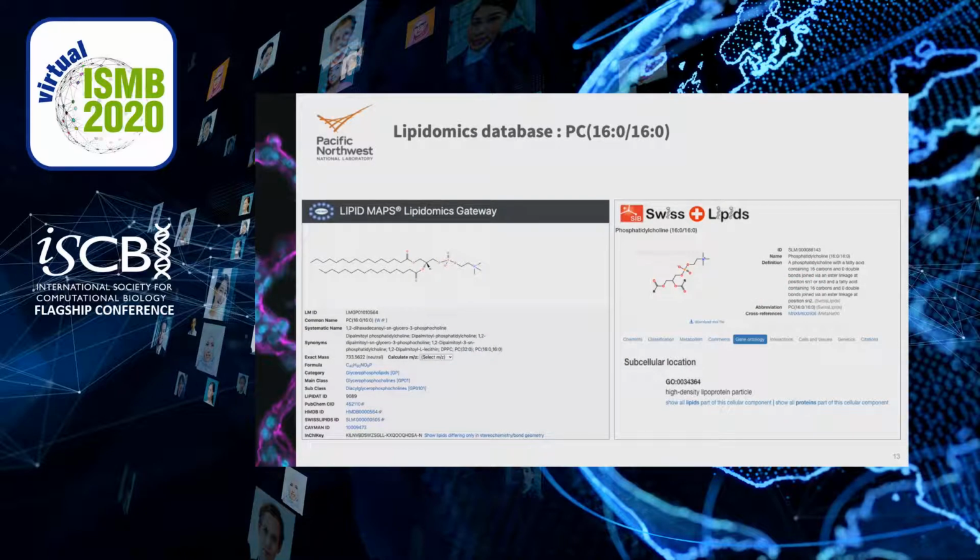Even today, if you look for this very specific lipid on the 3 most up-to-date databases, namely Lipid Maps, Swiss Lipids, and HMDB, there is no real good association of lipid ontologies with that molecule. On Lipid Maps, there is no association with any ontology terms.